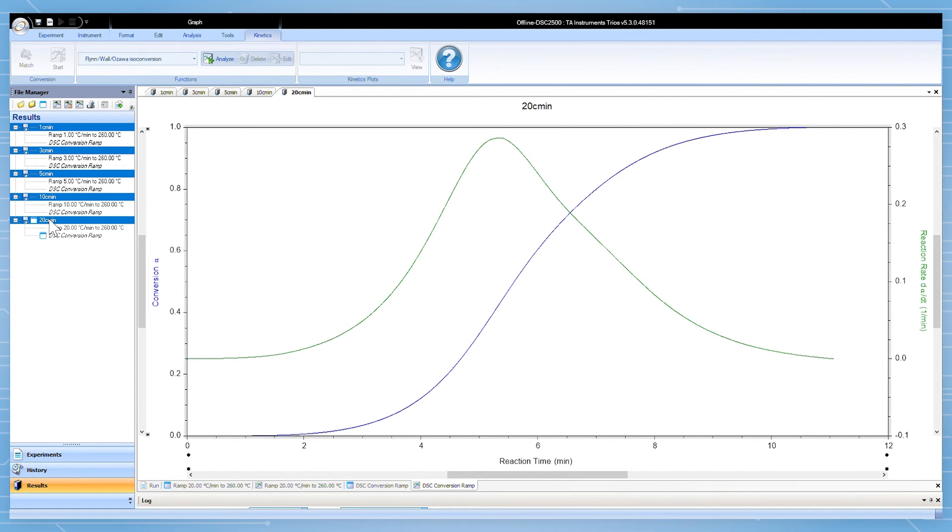For example, if you tried to perform an analysis with an isothermal model on files that were not performed with an isothermal segment, the analyze button will be grayed out.